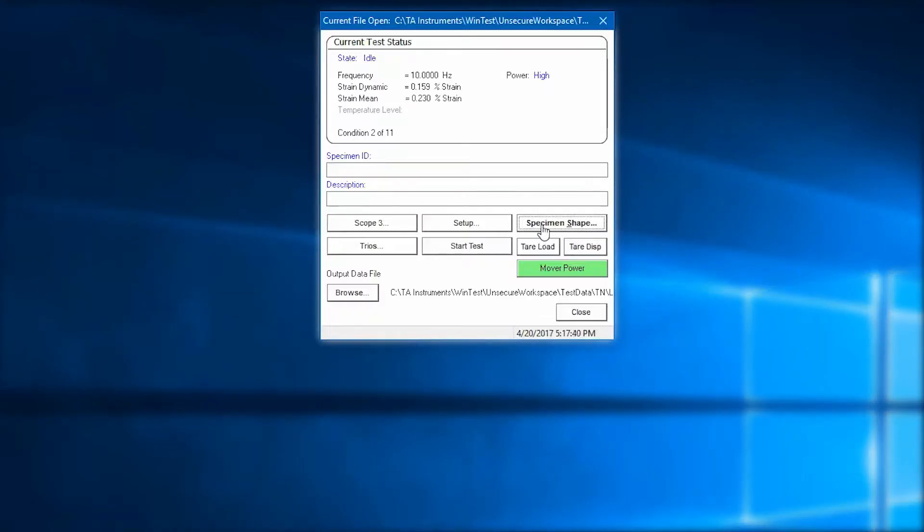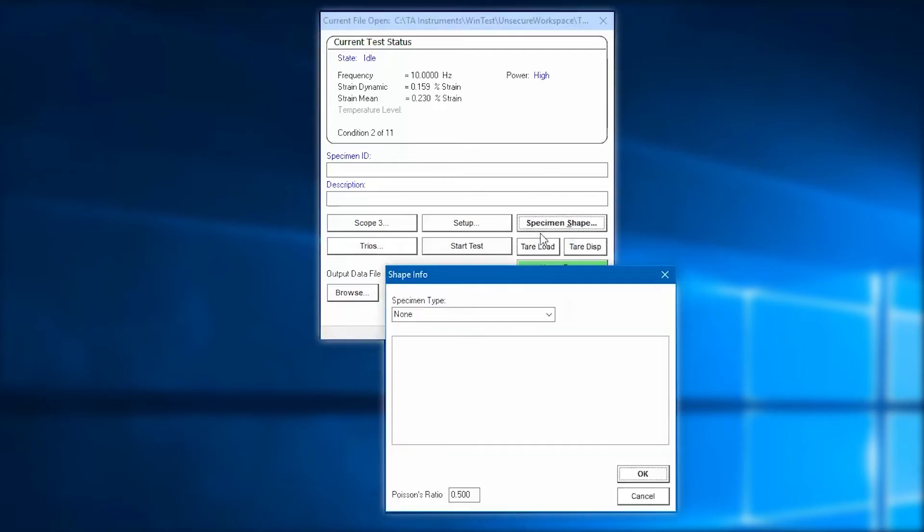In the DMA application, I click the specimen shape button to enter my specimen information. I click specimen type.